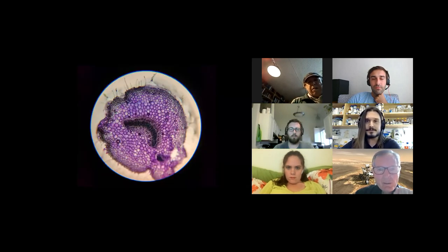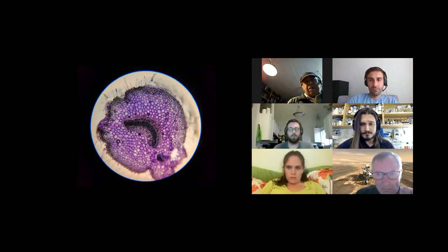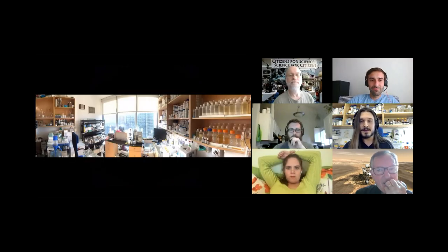So I started with this. This was the first microscope image I've ever taken. I used fountain pen ink from my dad's inkwell and a lucky bamboo that I chopped, and my mom graciously allowed me to do so. And I put it under this Fisher Price microscope that I got as a kid. This is actually a scan of a 35 millimeter picture that I lined the camera up to. And eventually this small lab underneath my bed evolved into this, which is my lab today.